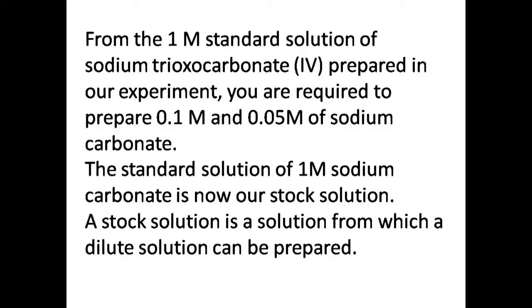In preparing a series of diluted solutions, the standard solution from which the solutions of lesser concentration will be prepared, as we know, will have a higher concentration than the diluted one.